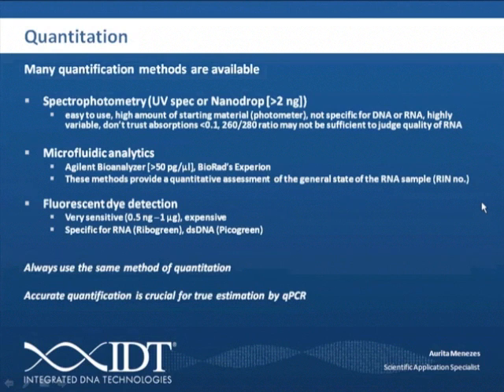Okay. When would you recommend using a double quench probe? Actually, if I have a customer who's just using FAM and Iowa Black FQ, especially FAM, the fluorescent dye, I would recommend them using the double quench probe. In head-to-head comparison, the double quench probe has so much lower background than any other dye quencher combination tested that to me it should be the first choice if you're using FAM.